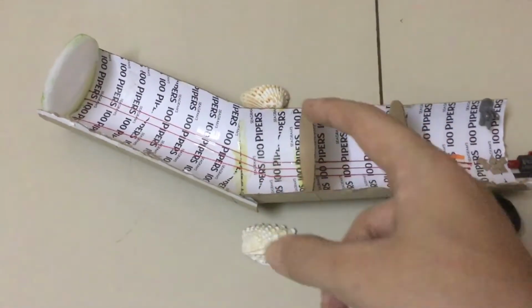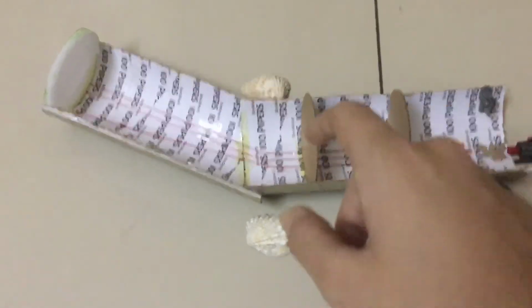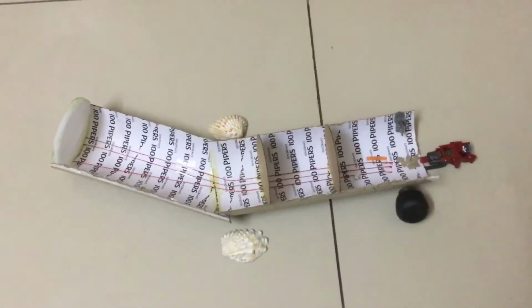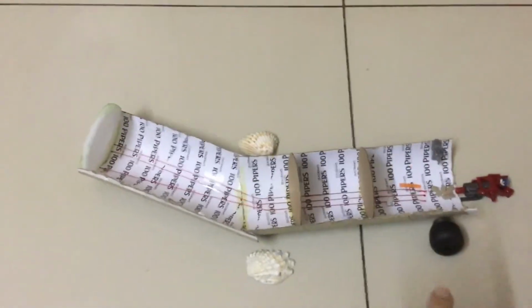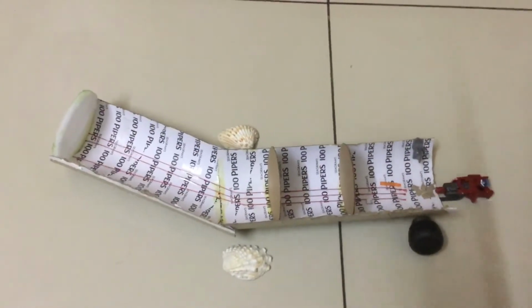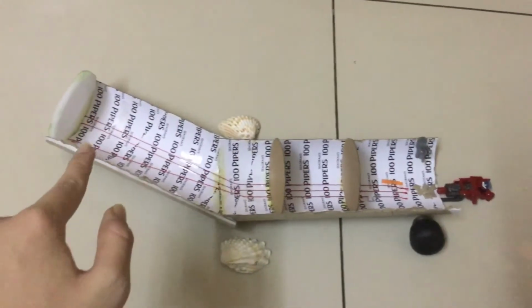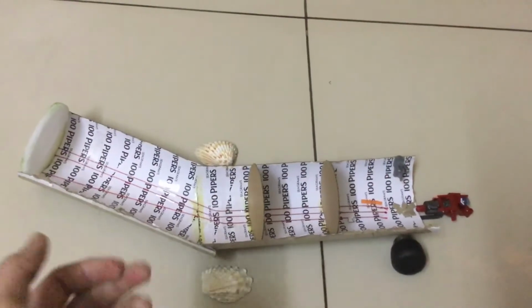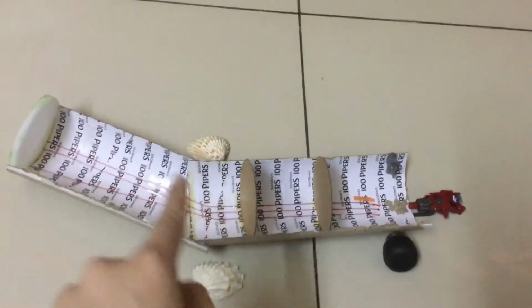Now, depending on the mass, it will either bend less or bend more. So the more mass the element has, or the certain isotope of the element has, it will not deviate from its path as much, as represented by this lower line. And then the less mass it has, the more it will be deflected. So as you can see, this line here, since it has not deviated that much from its path, clearly has more mass than these two beams, which have been deflected more.